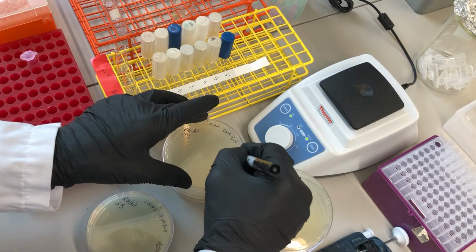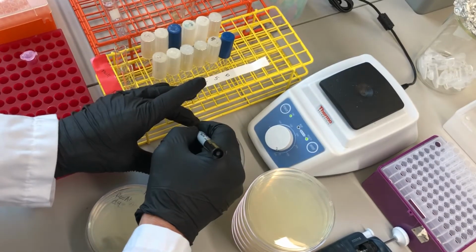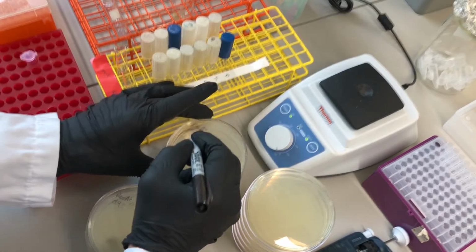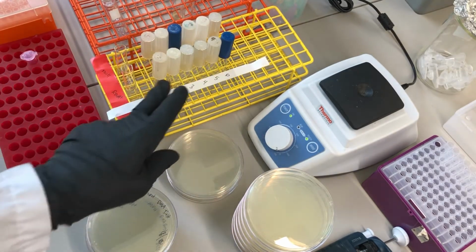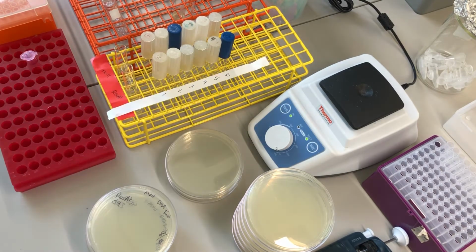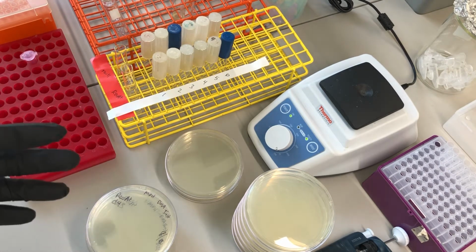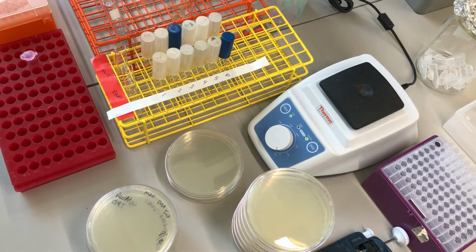Just with the reaction, the 20 minutes, and then they get moved to the serial dilutions containing 0.85% NaCl. Yes, in these tubes would be 900 microliters of 0.85% sodium chloride, so you can do your serial 10-fold dilutions. But before you dilute, you add the catalase. You add another 100 microliters of your catalase solution, and you vortex, and then you can look at the tubes to see if there are any bubbles accumulating.